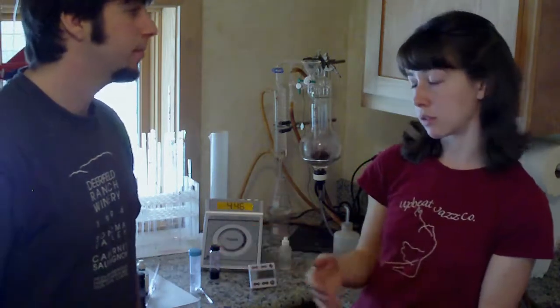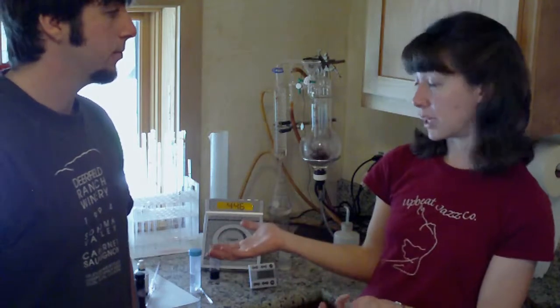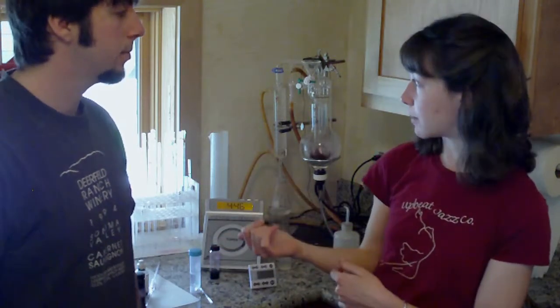And it takes time. Yeah. So you have to wait for the results. We can get the results very quickly here. And, you know, in the beginning, we had to spend some money, a chunk of money, to buy all this lab equipment, but it's very economical in the idea of saving.